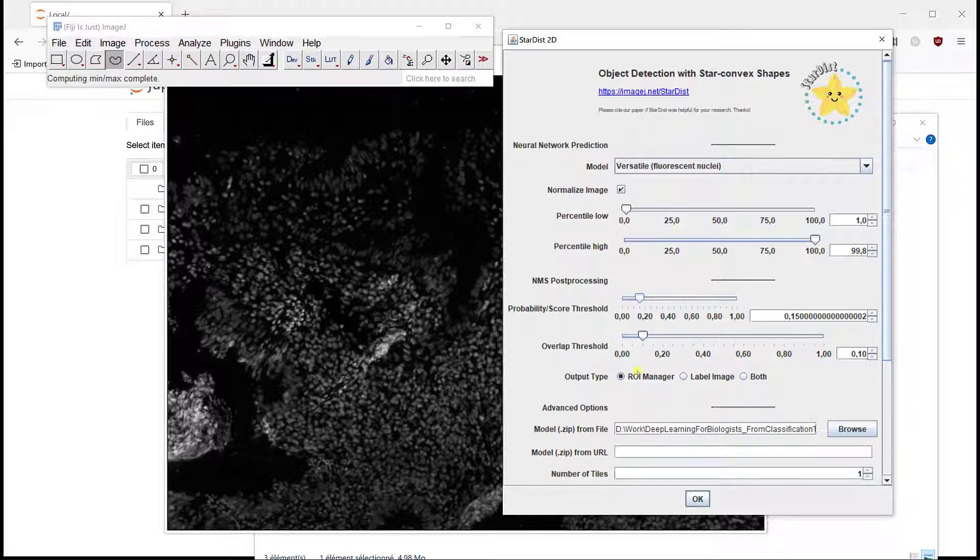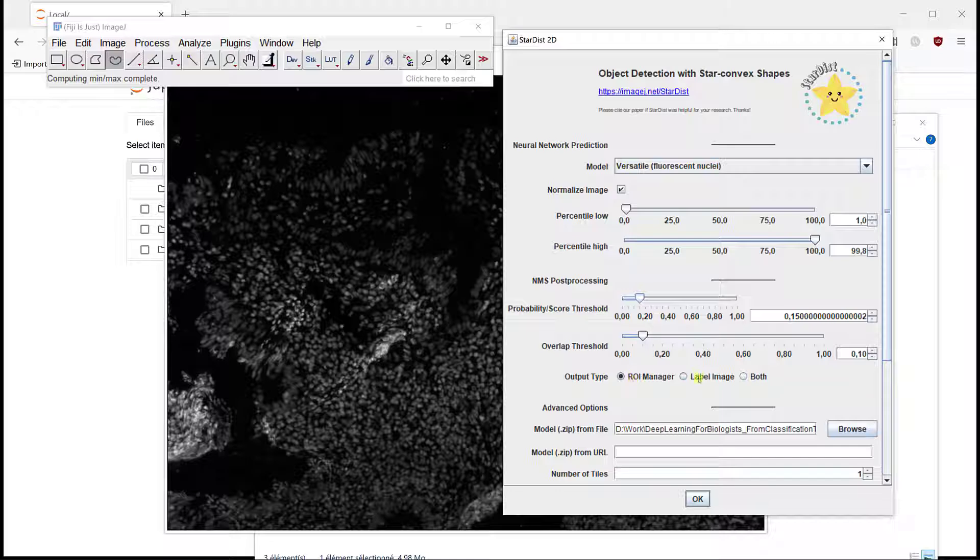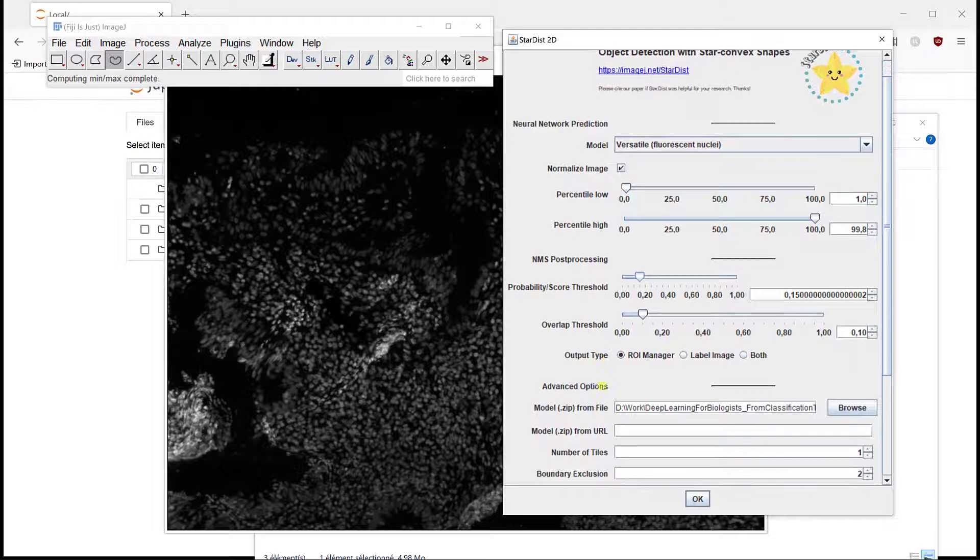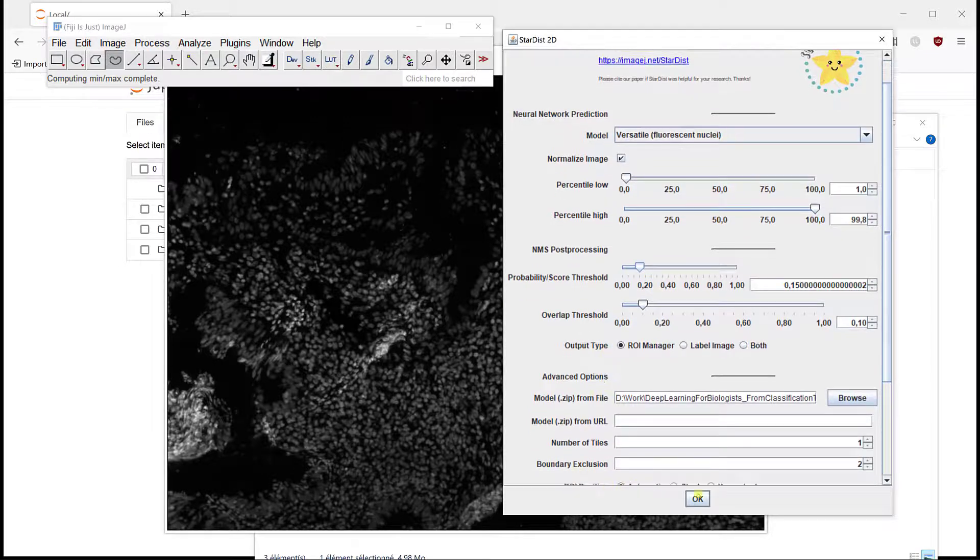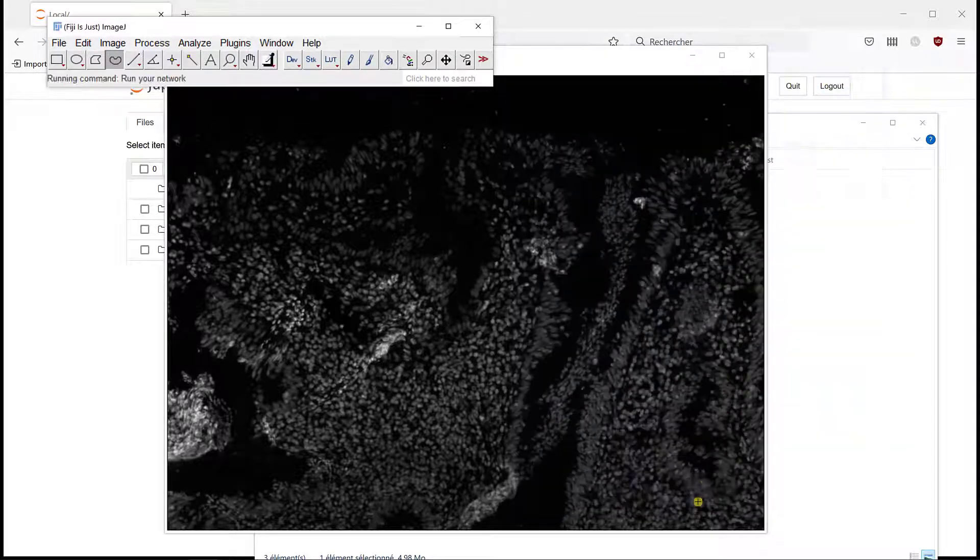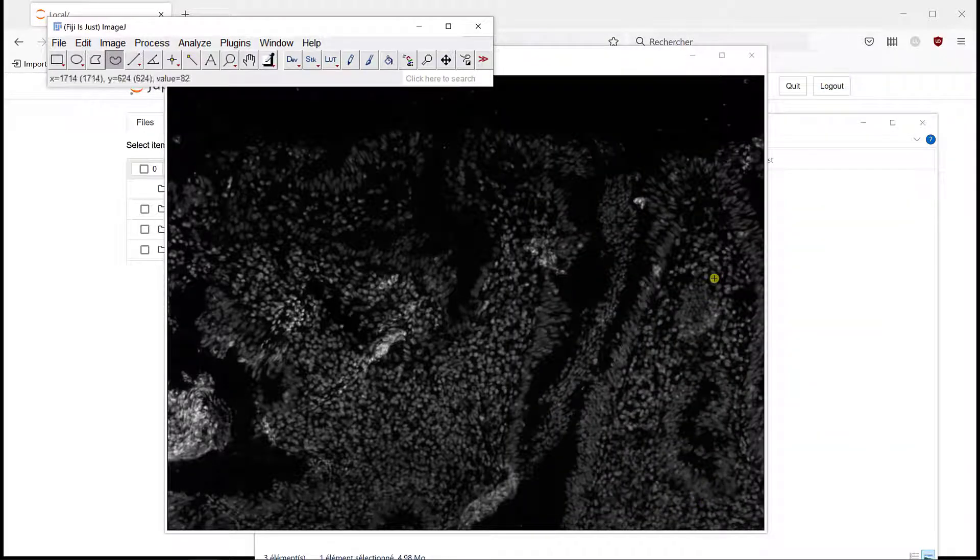And I can have a probability that is pretty low to try to segment as many nuclei as possible. I'm going to extract ROI, label image, both just ROI image, so we can actually look at the results in this image. And I can run it.